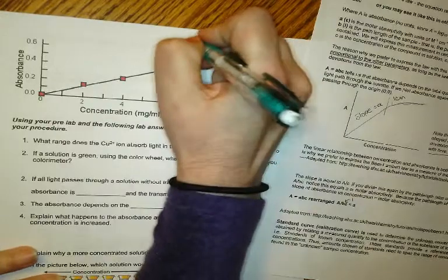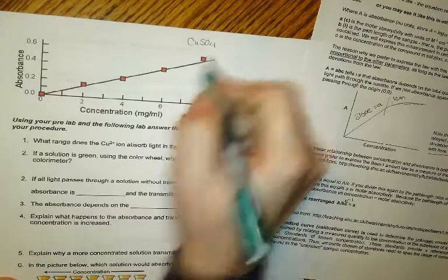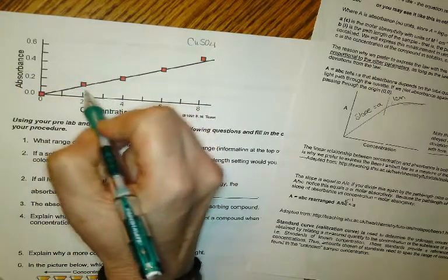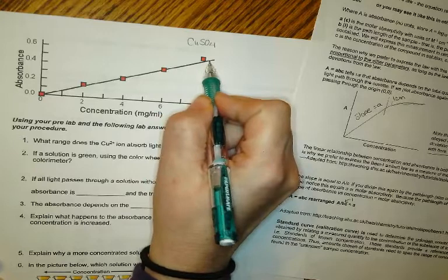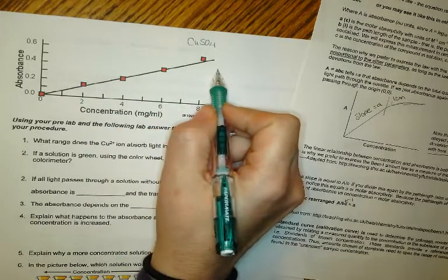We could call it copper sulfate. We could call it anything, but it's just one sample. And if I make this sample at many different concentrations and I measure the absorption, I will get this straight line, okay?